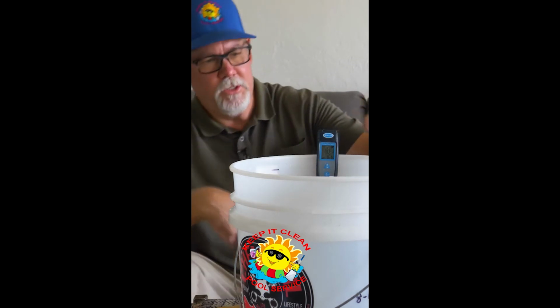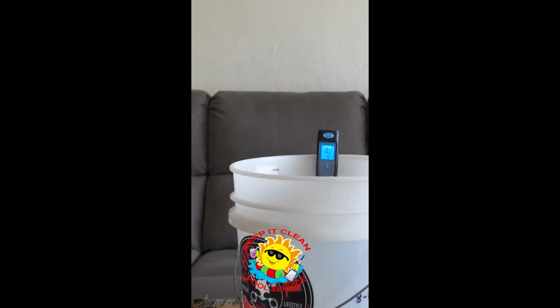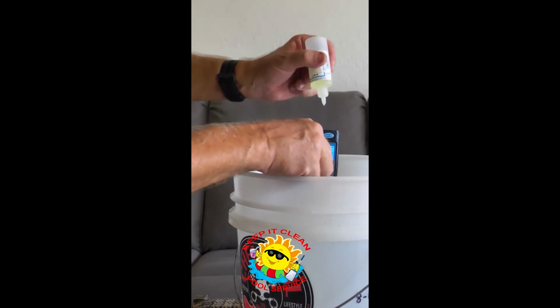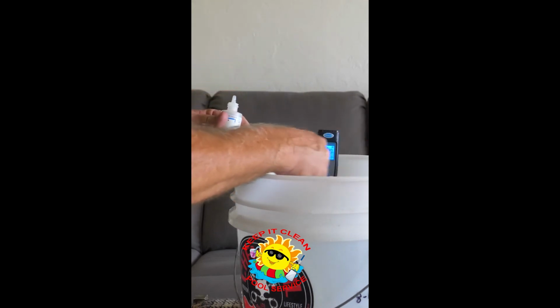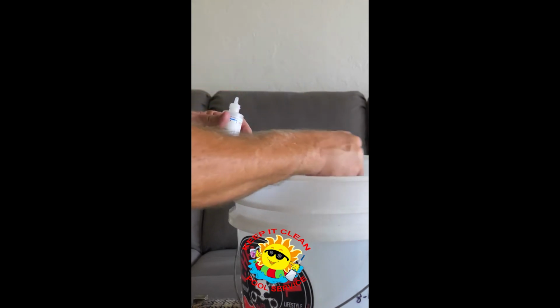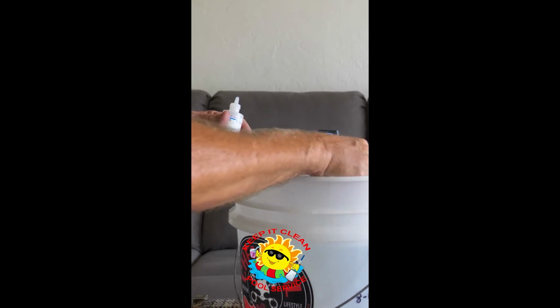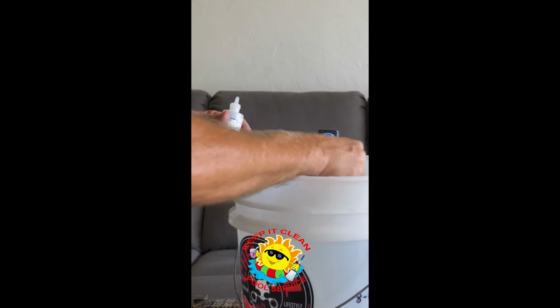So let's get down to this here, and let's find out what we got going here. We got an 8.0 pH. Right now, let's count how many drops we got going here to drop this down. 1, 2, 3. There's 3 drops.